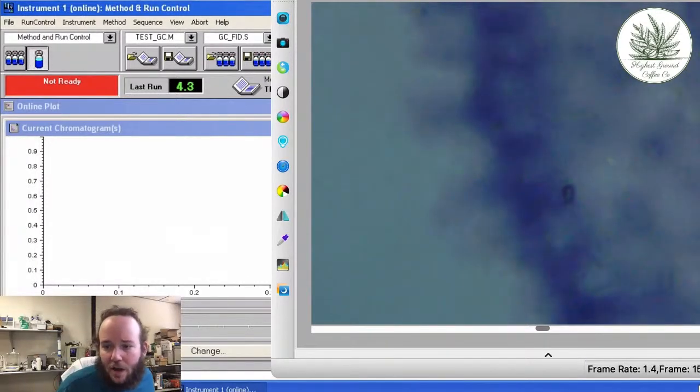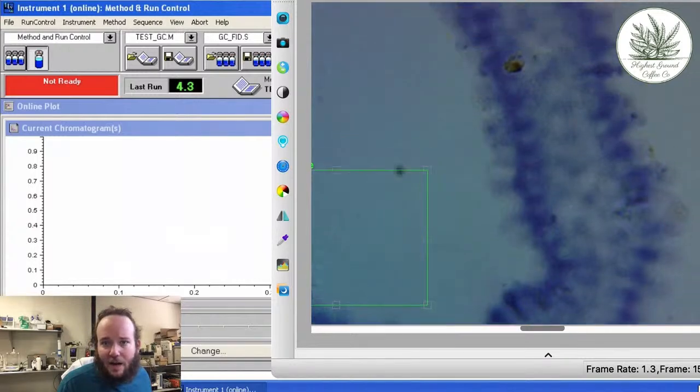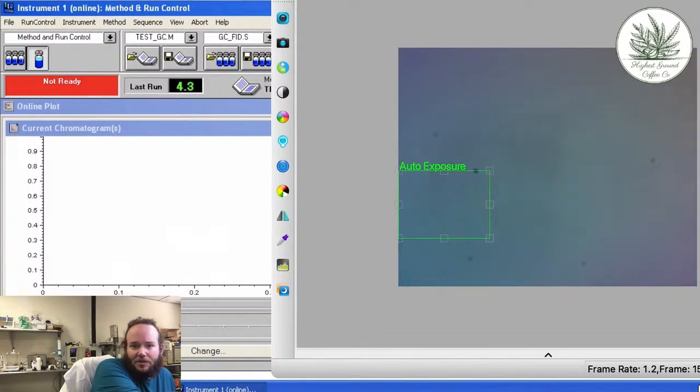So what are the little offshoots? I'm not sure the specific plant terminology for them, but my guess, and that is what it is, a guess, is it's a similar type of structure to trichomes.